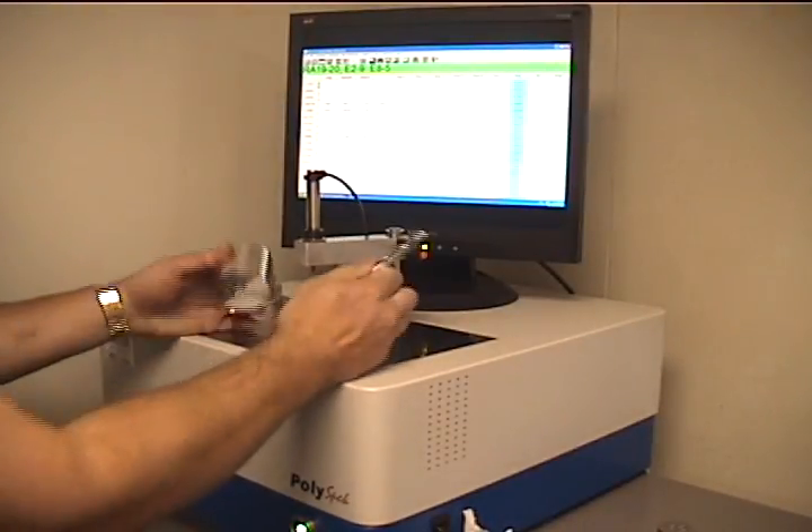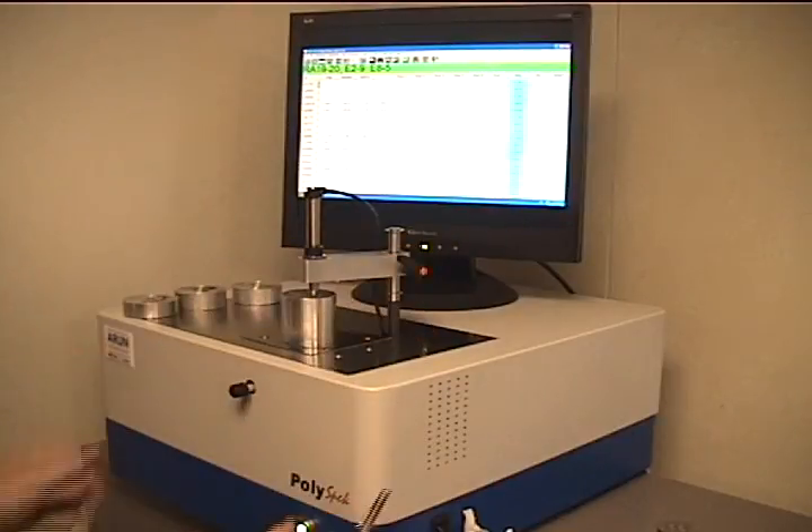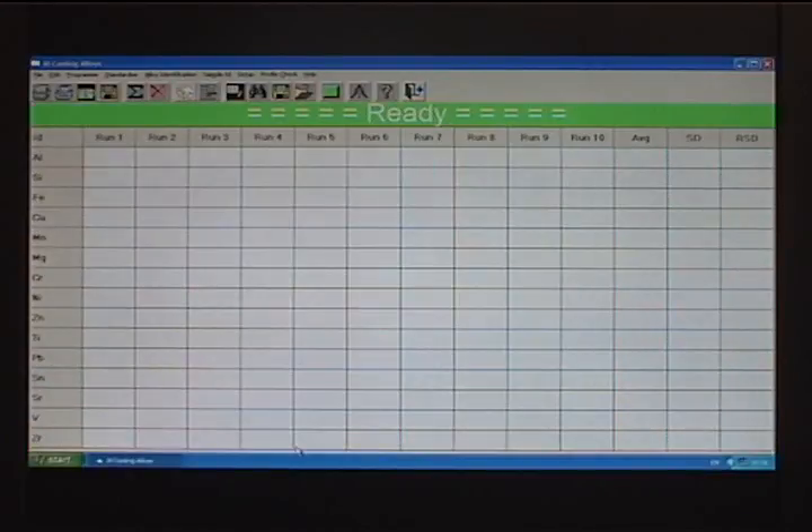Subsequent standardization samples are analyzed in the same manner. When all of the samples have been run, the correction table is displayed, highlighting any problem areas in red. The operator saves the corrections by hitting any key on the keyboard. The system is now ready to analyze samples.